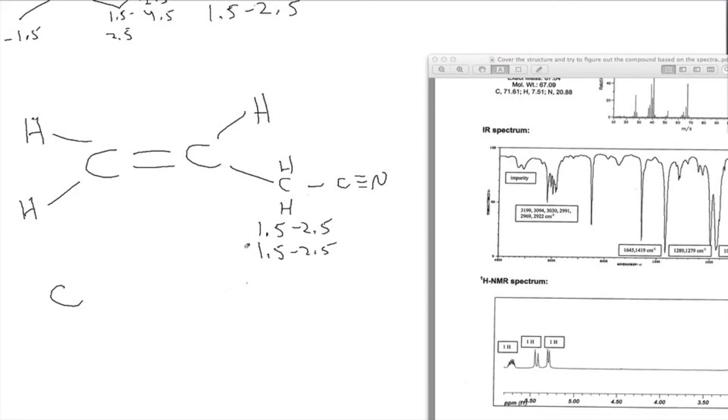Sorry, how would we explain the doublet? Is that a doublet? Sorry. Yeah, that is a doublet. On the CH2, is it because, well, I guess it's like 2 bonds away from that H over there. Actually, it works out just like we would have expected. I think this is adjacent to 1 hydrogen, so you would expect a doublet. Right. Okay, that's fine then.